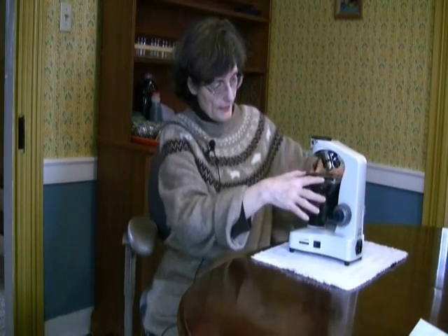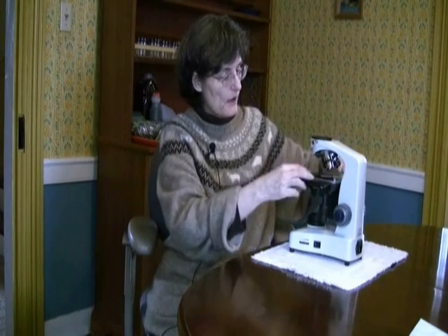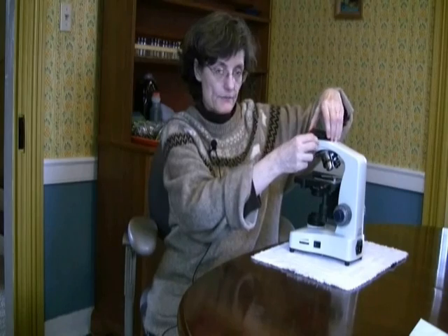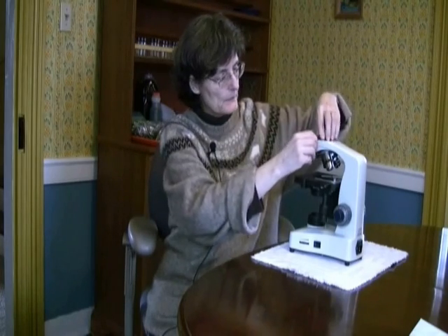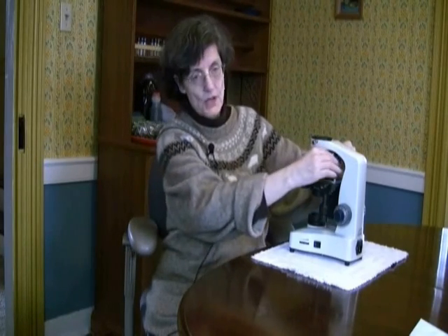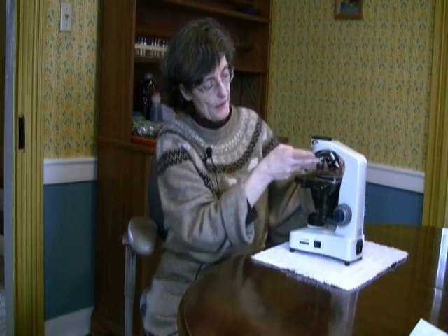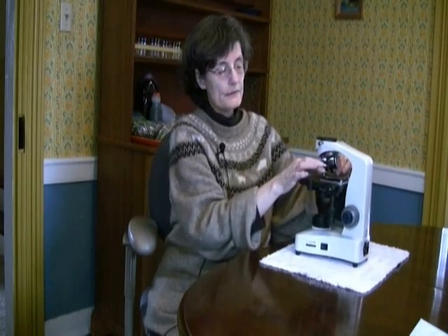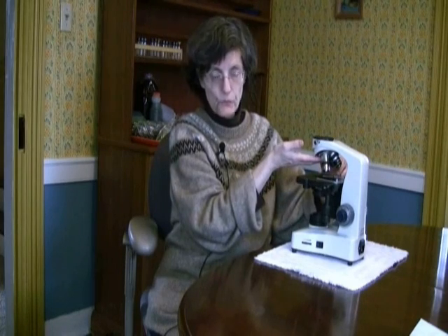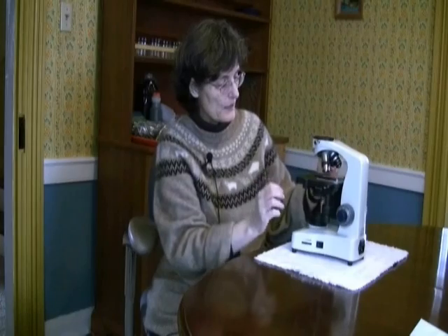The next thing we want to look at is that we've got covers on all the little openings in our microscope. So you should have a cover where the headpiece will go. You should have covers on any open objective places. Here you can see that we have the 4x lens, the 10x lens, and the 20x lens already on the microscope, and then we have another place for the 40x lens. So we'll be putting our 40x lens in there.